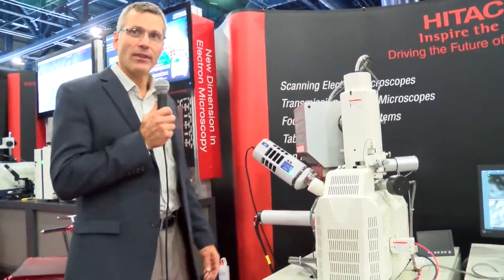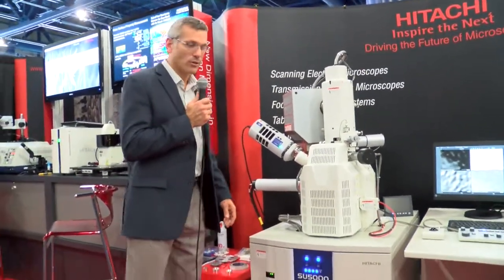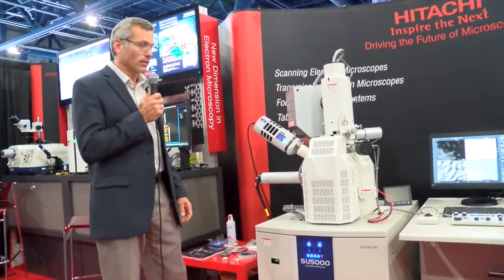Yes, hello. My name is Rod Baird. Welcome to ISFA 2014. We're here introducing today the SU5000 Variable Pressure Field Emission Microscope — Hitachi's newest instrument in our SEM product line.